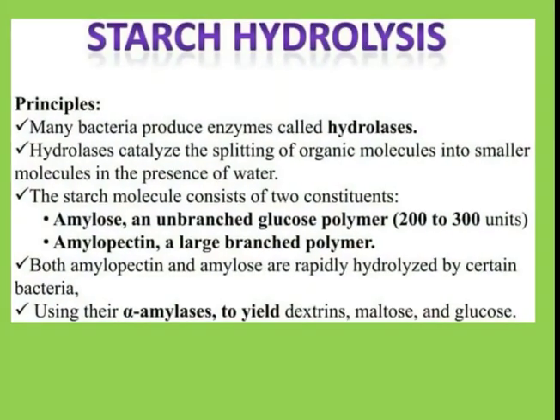A starch hydrolysis test, also known as an amylase test. Many bacteria produce the extracellular enzyme in the class hydrolase known as amylase. The hydrolase enzymes catalyze the splitting of an organic molecule into smaller molecules in the presence of water.